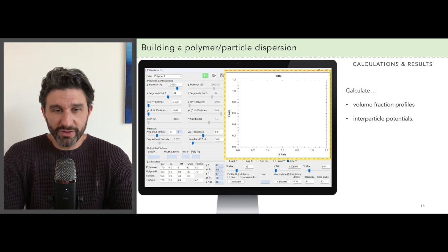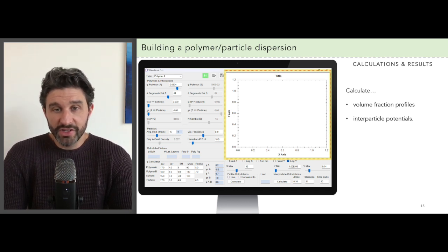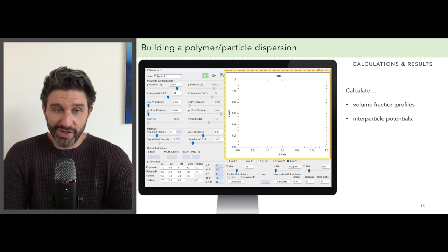In the next two episodes of this webinar series we'll go through these two outputs in detail via case studies and show how these two outputs can be useful for formulation prototyping.